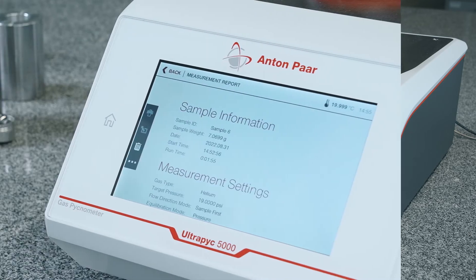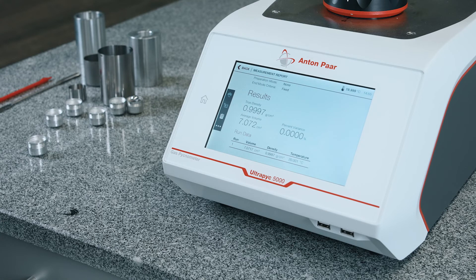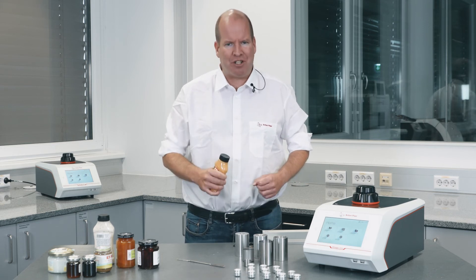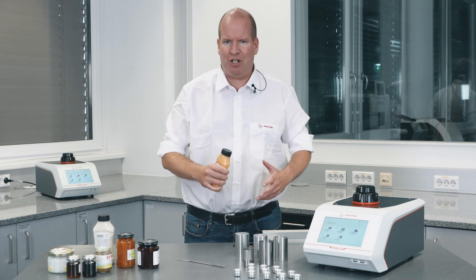The large touchscreen has an intuitive interface, making viewing results easy. Choose the Ultrapyc 5000 density analyzer to achieve batch-to-batch consistency and fulfill all regulatory packaging requirements.